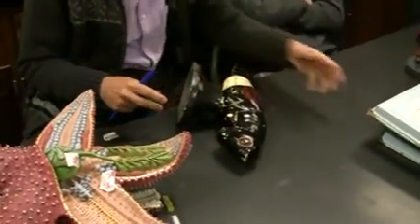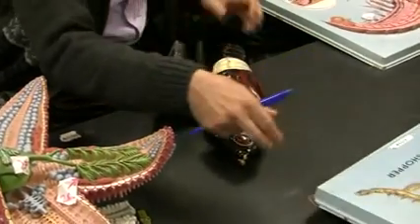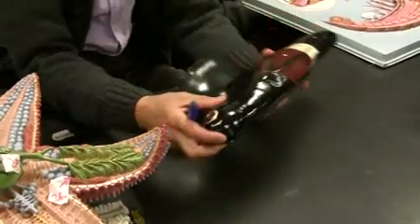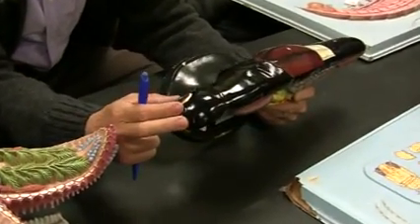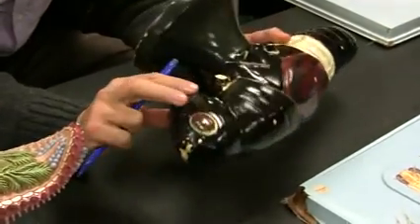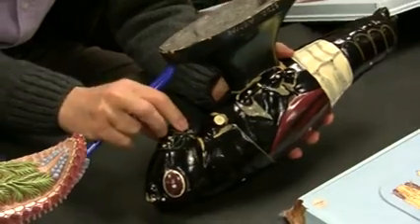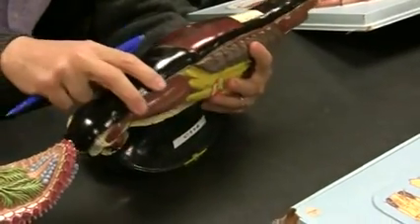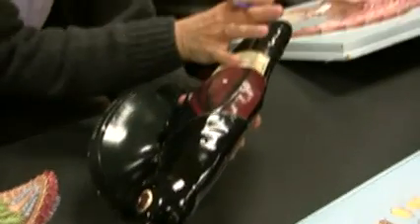Grasshopper, is that right? Is that the only grasshopper we have? No, we have another grasshopper. Okay, so we have one to dissect. Compound eye, simple eyes here, and of course all of the mandibles, you know, grasshoppers have mandibles. Then this would be the thorax, that would be the abdomen.